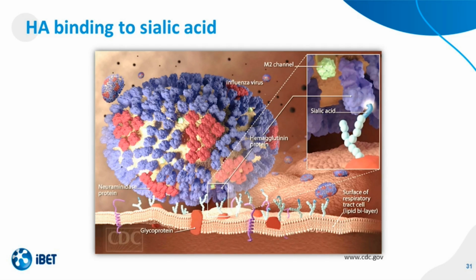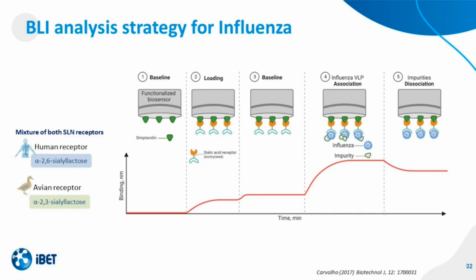And for influenza virus quantification of in-process sample analysis during the bioprocess development, we usually use hemagglutinin protein. And hemagglutinin protein plays an important role in host tropism, since the viral receptors vary according to the host, impacting infection and replication of influenza virus amongst species. For instance, avian influenza viruses engage preferentially alpha-2,3 linked sialic acid moieties, whereas human-adapted ones have a higher affinity to alpha-2,6 sialic acids.